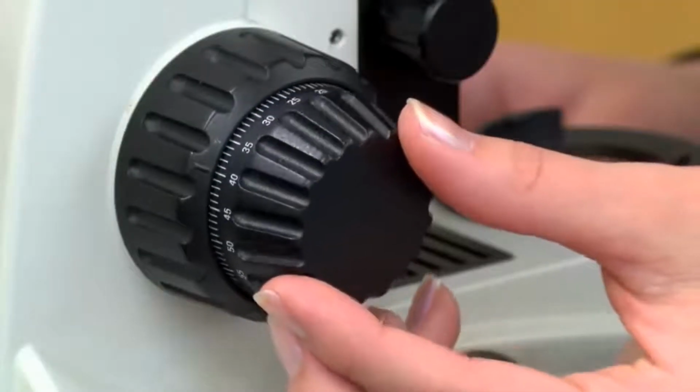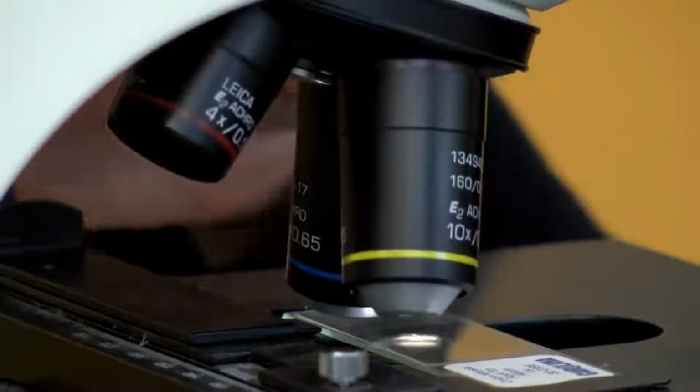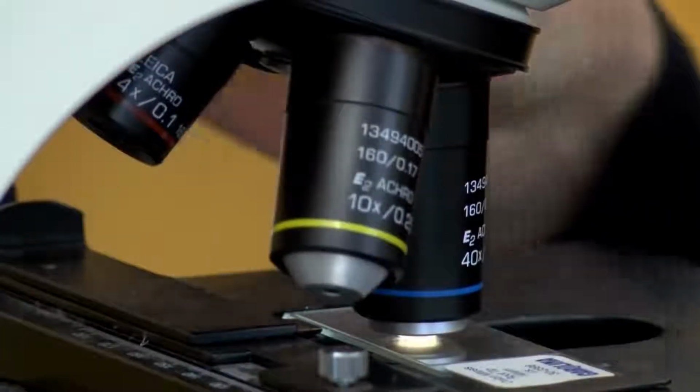Your specimen should be nearly in focus, and you should only need to use the smaller, fine focus knob. Again, center the specimen, and you are ready to move to the highest power lens, 40x.